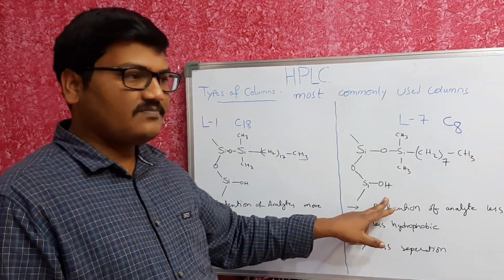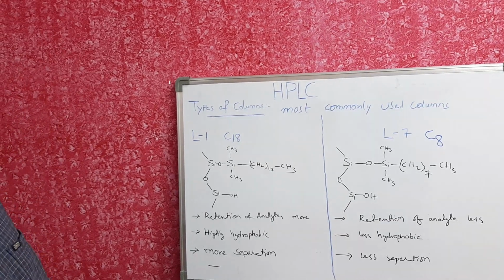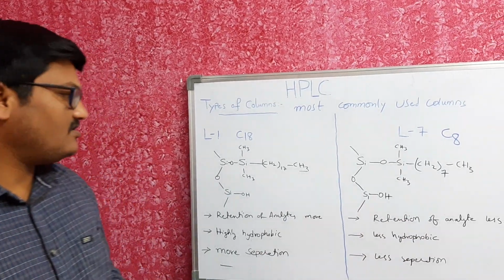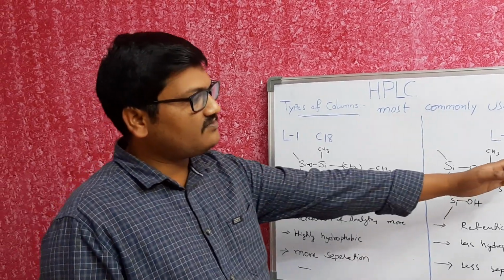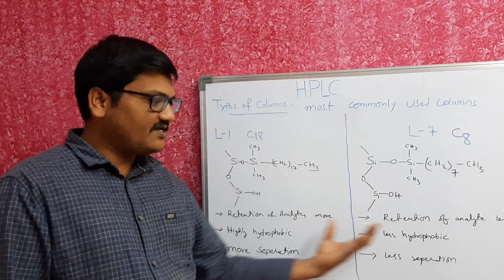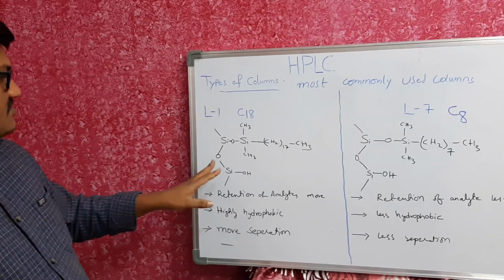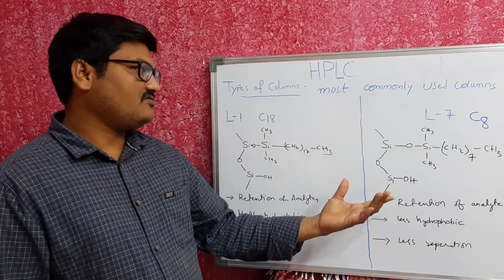Any non-polar compounds which are eluted at more retention time in the C18 columns, in those cases we can use C8 columns. ఏవైనా నాన్ పోలార్ శాంపిల్స్ ఉండి చాలా ఎక్కువ రన్ టైమ్స్ ఉన్నట్టయితే మనం C8 కాలం కానీ వాడినట్టయితే దీనికంటే C18 కాలం కంటే కూడా కొంచెం ఎర్లీగా అంటే రిటెన్షన్ టైం అనేది రన్ టైం అనేది మనం తగ్గించుకోవడానికి ఛాన్సెస్ ఉంటాయి అన్నమాట. These are the applications of the C8 and C18 columns.